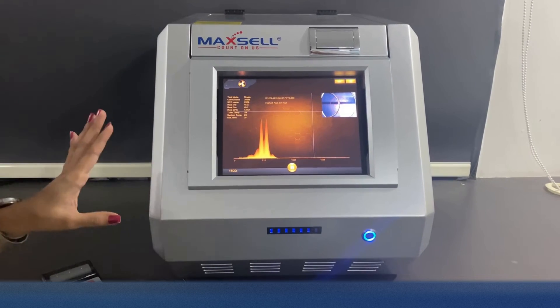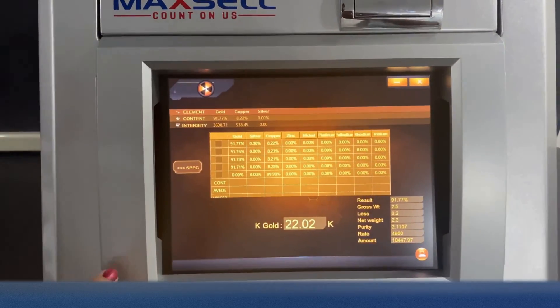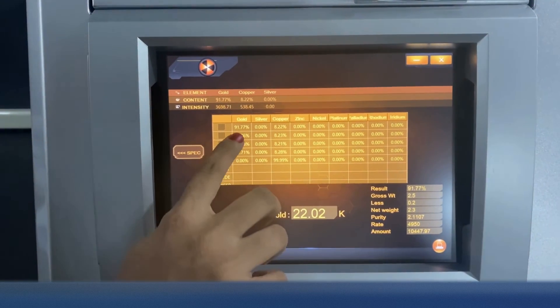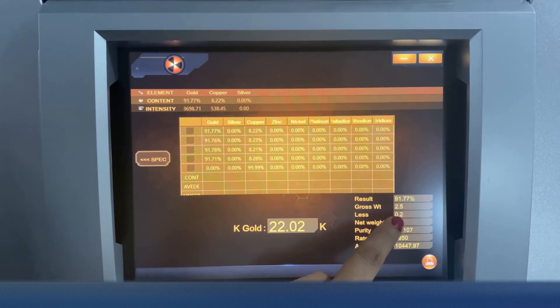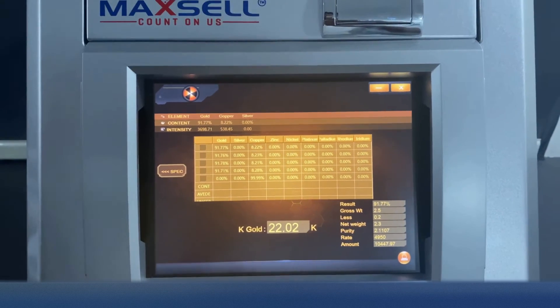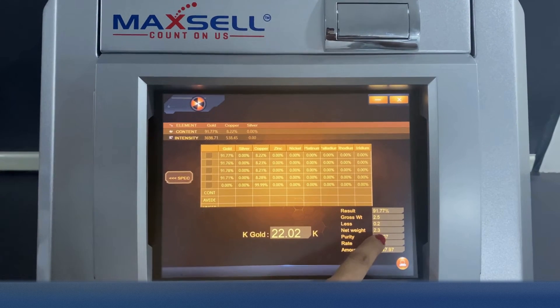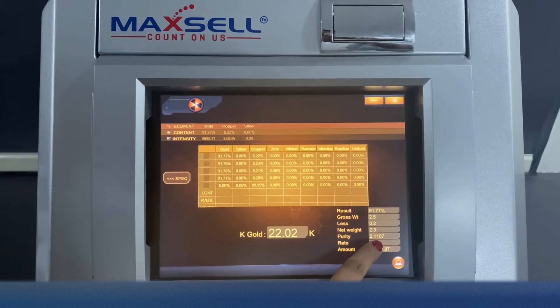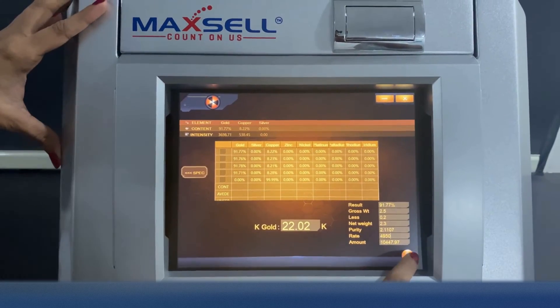Here we have our gold results. The gold composition is 22 carat, 91.7%. The gross weight is 2.5 grams. The machine also tells you about any other stone or wastage present in the sample. In Maxell Carrot Pro, you can input the stone weight to calculate the net weight of the sample.